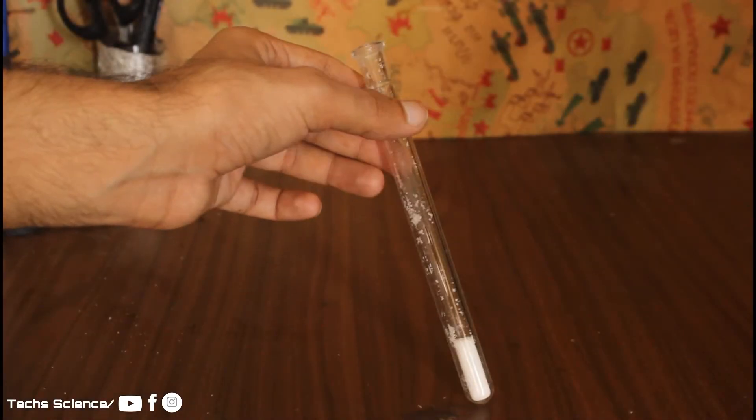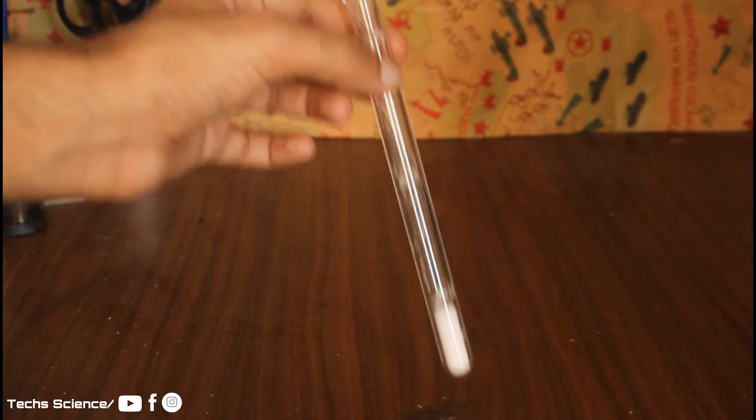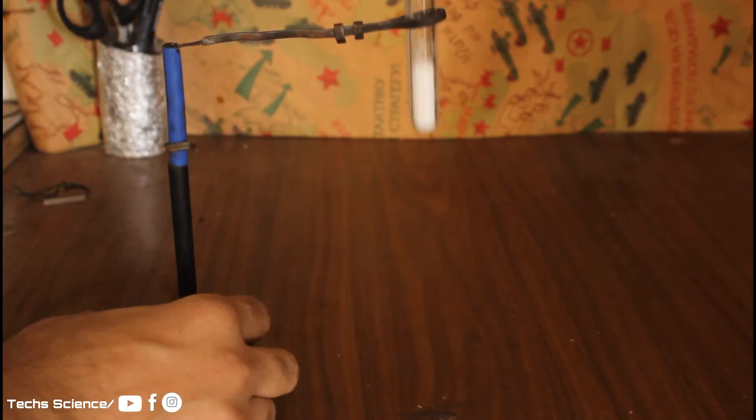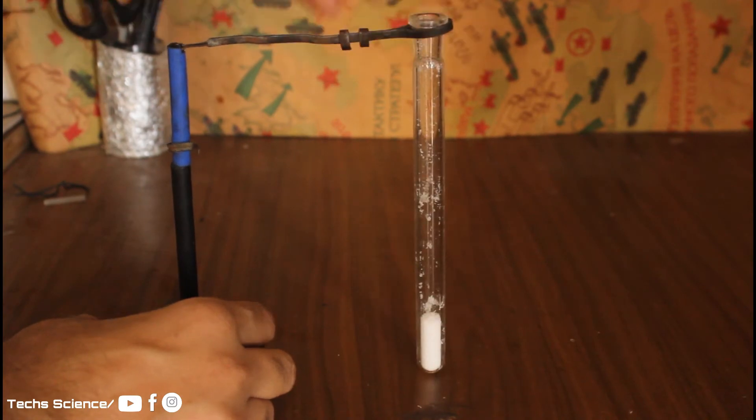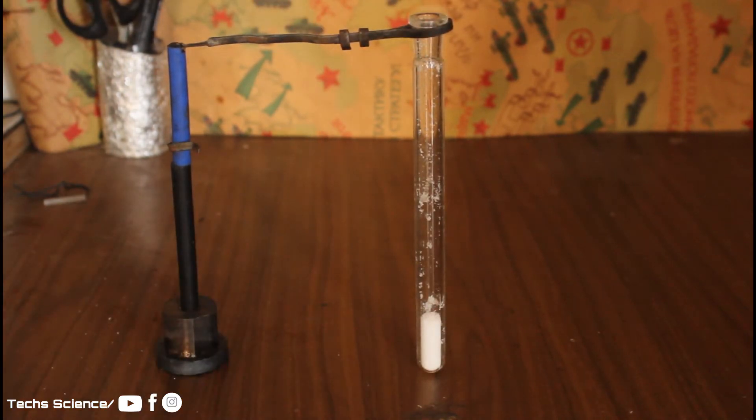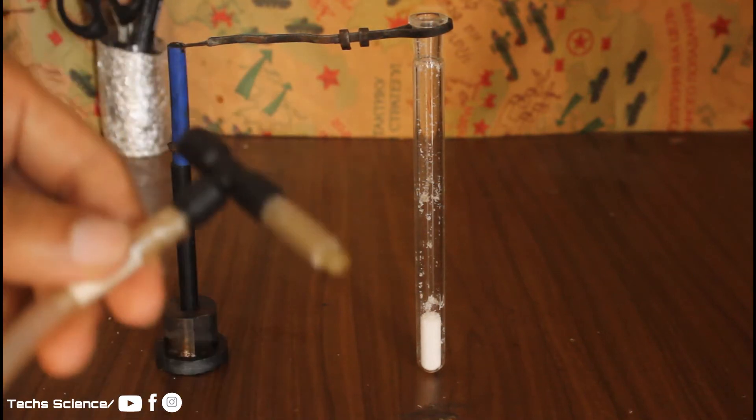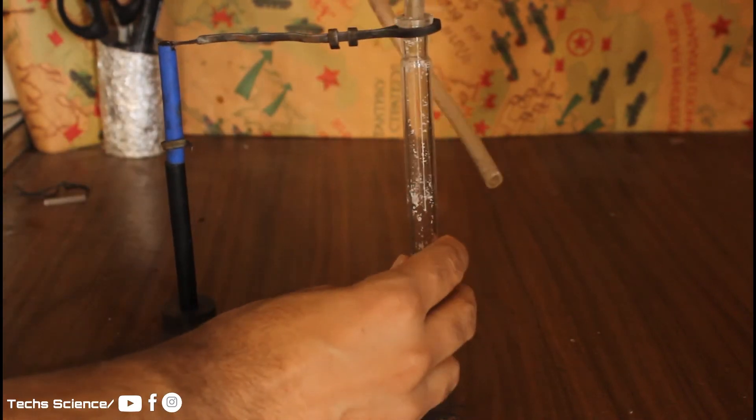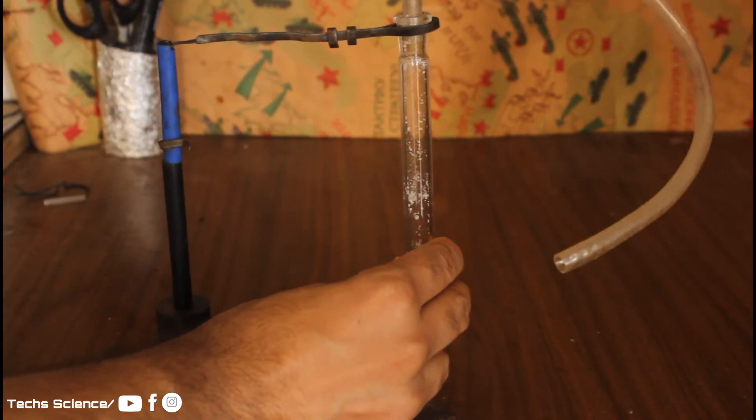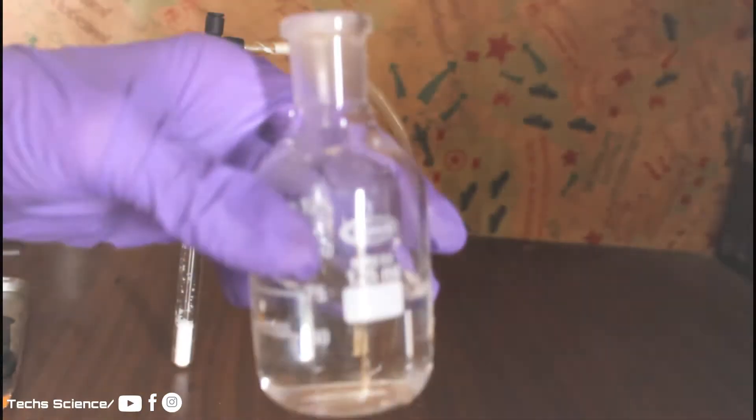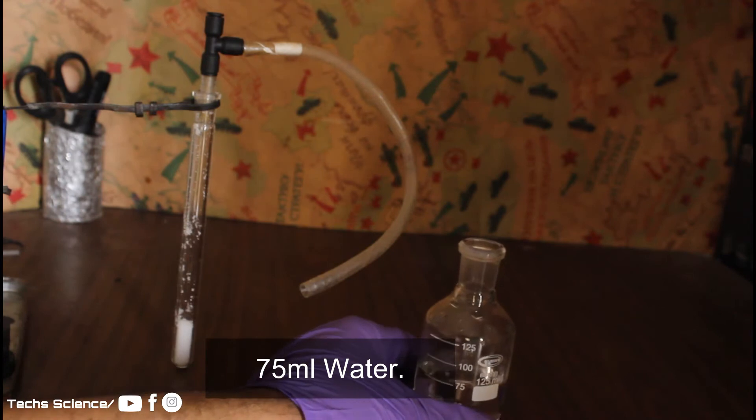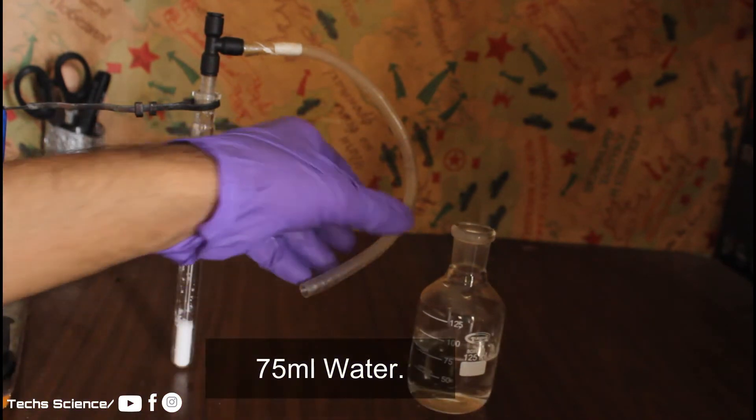I have taken common salt, or sodium chloride, in this test tube. And I am using this three-way tube connector where one end is going inside the test tube, the opposite will be used to pour the sulfuric acid, and the remaining one is to collect the HCl gas.